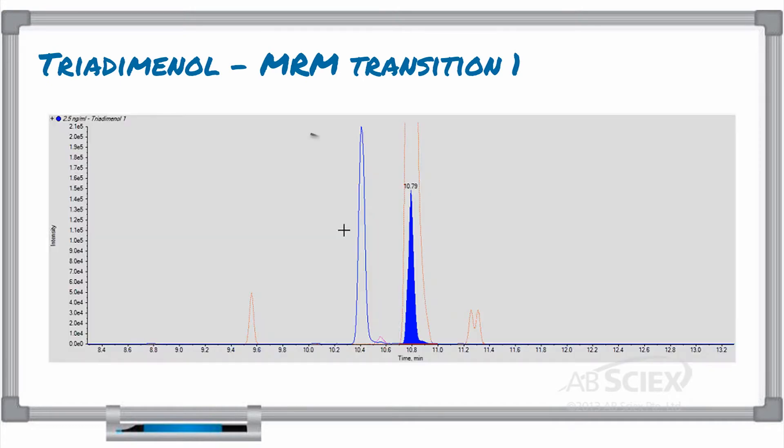In this experiment, we want to use our MRM-cubed transitions to quantify the compound triadminol in bean samples. In the case of this compound, a structural isomer with identical MRM transitions appeared in the chromatogram at a retention time of 10.4 minutes for both selected MRM transitions.